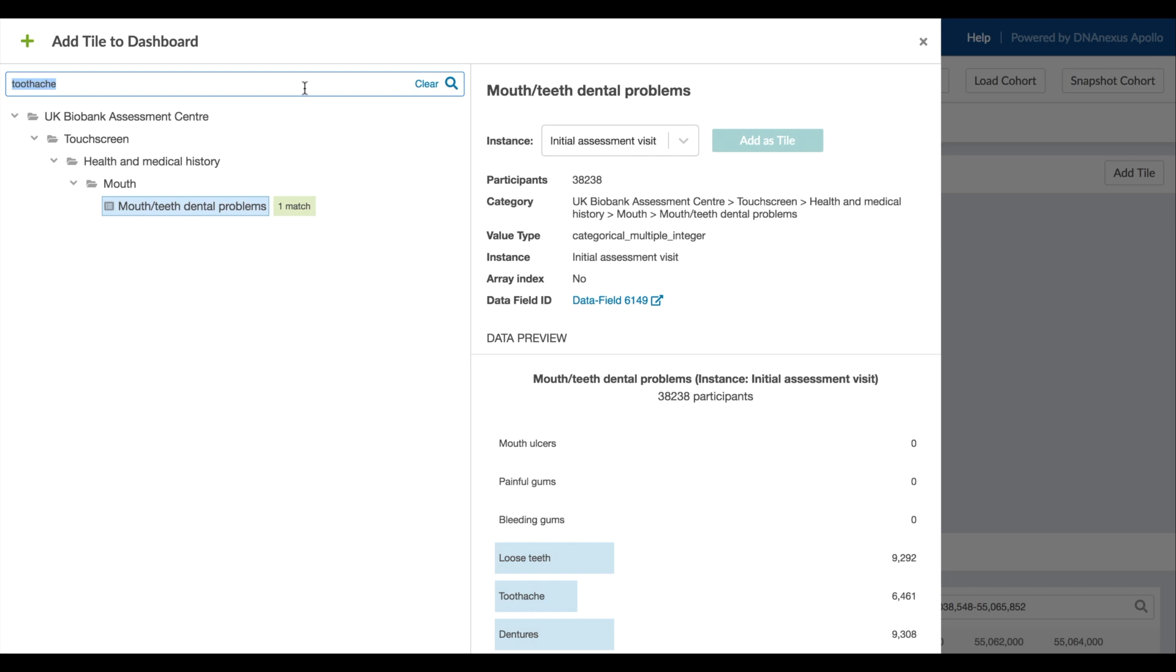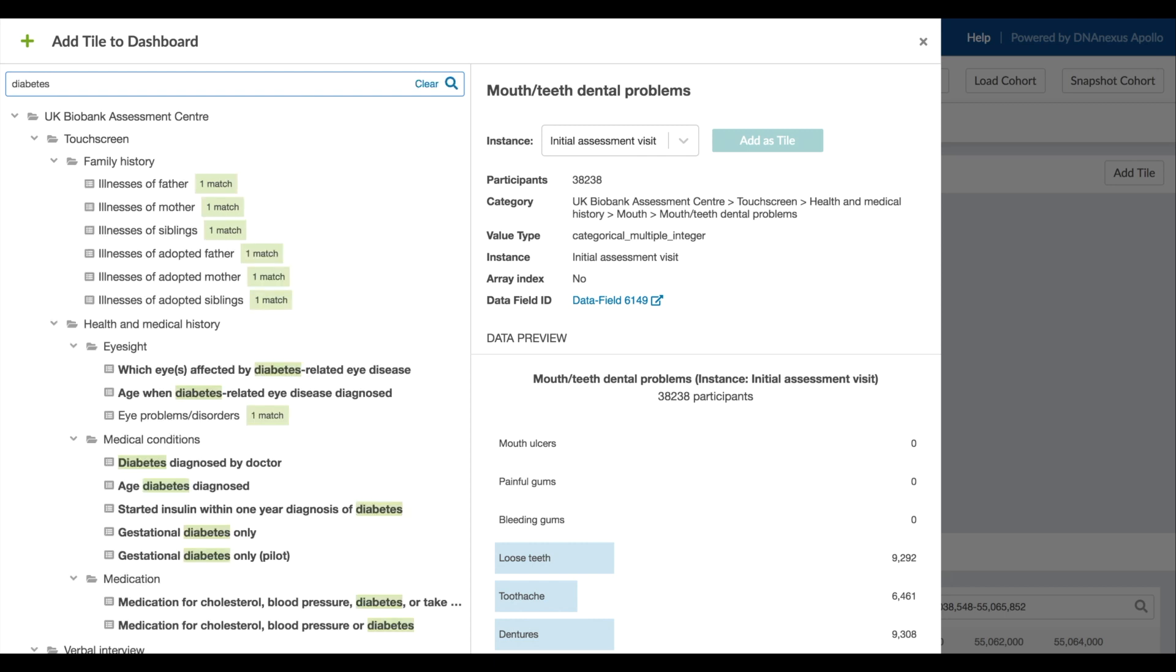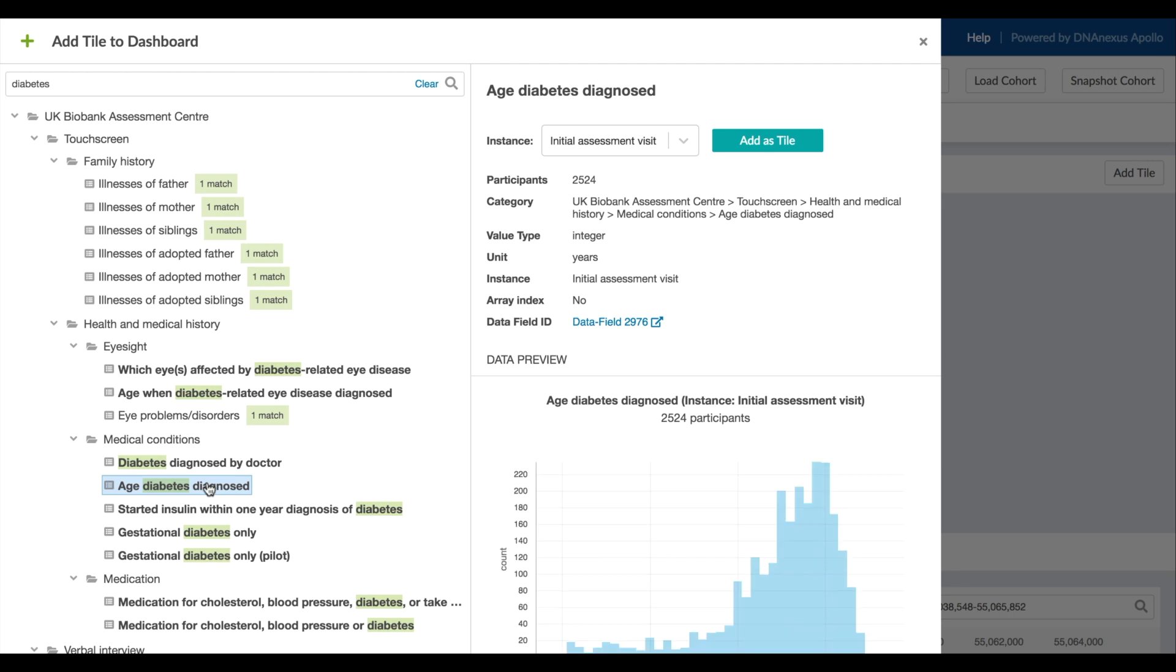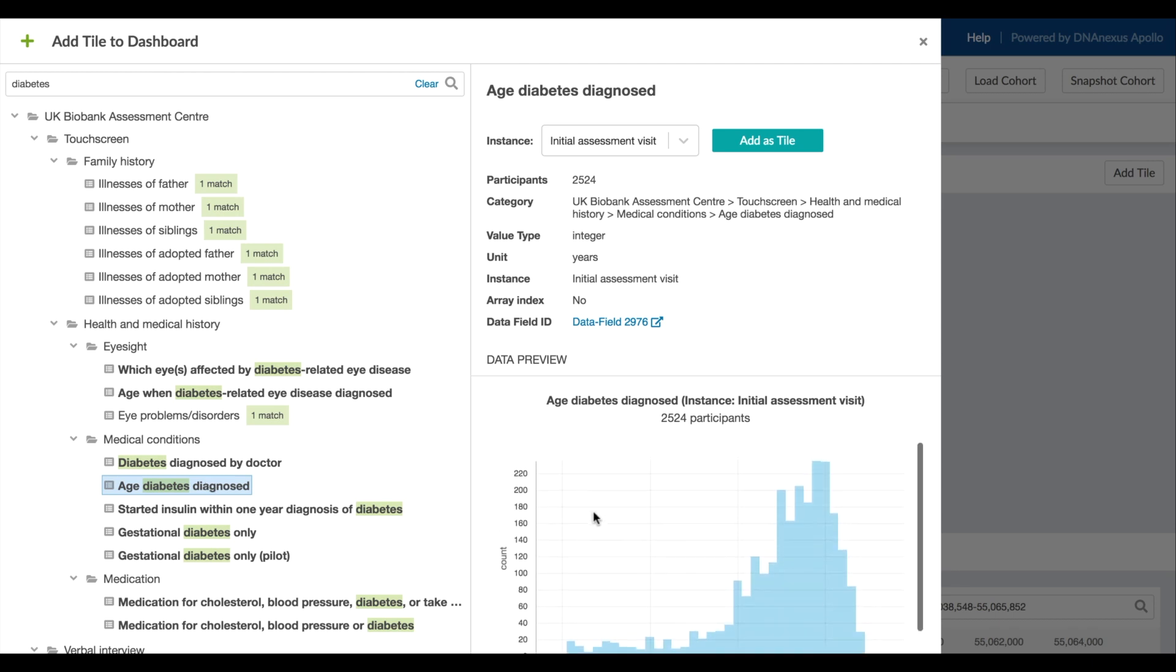Let's try another search term, diabetes. This search matches several different phenotypic fields for this data set. Here we have some self-report fields. Let's add age at diagnosis so we can see how time-based data types are handled.